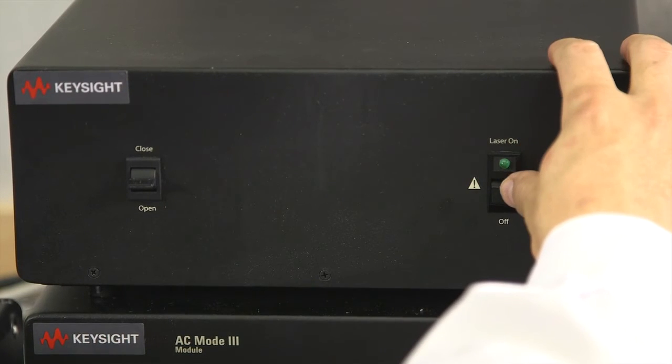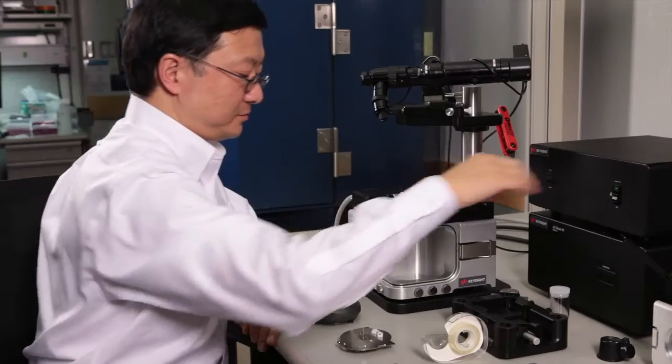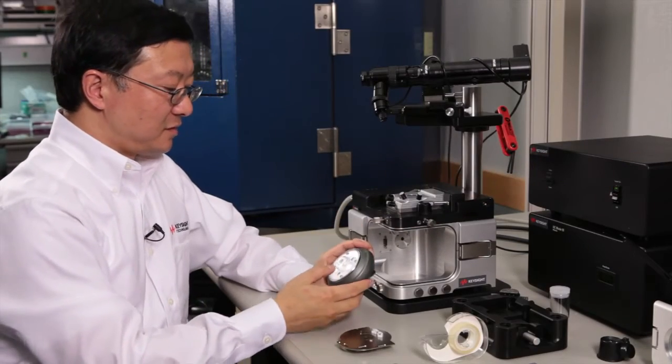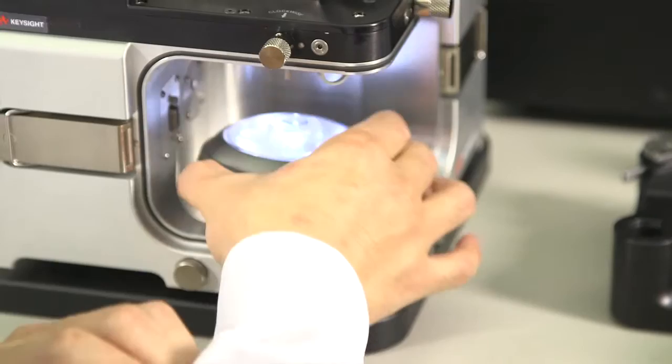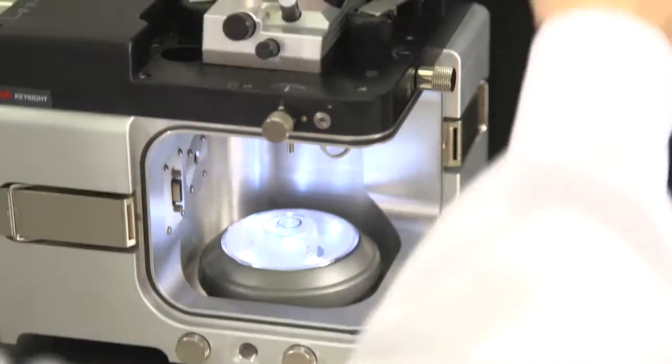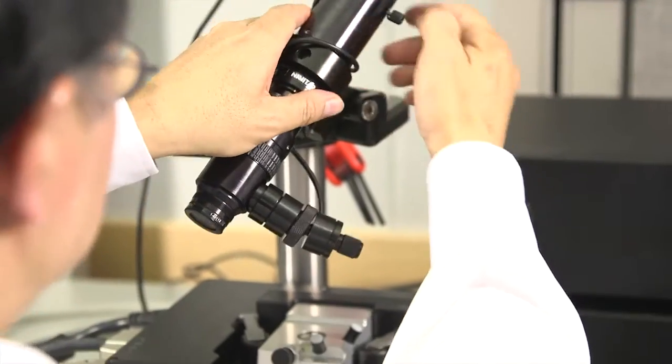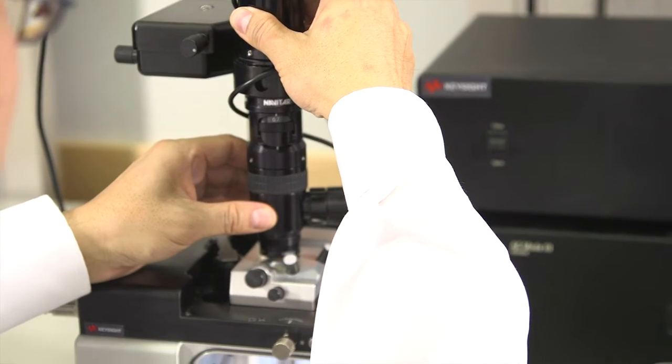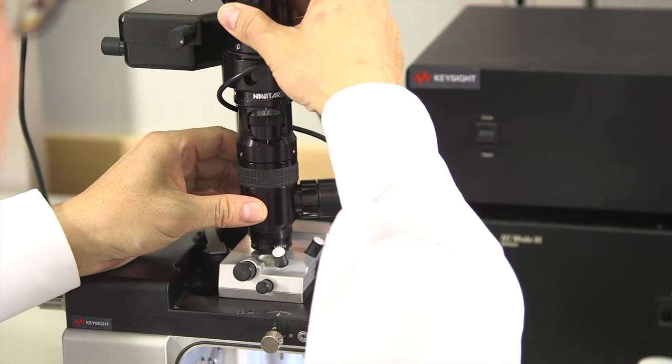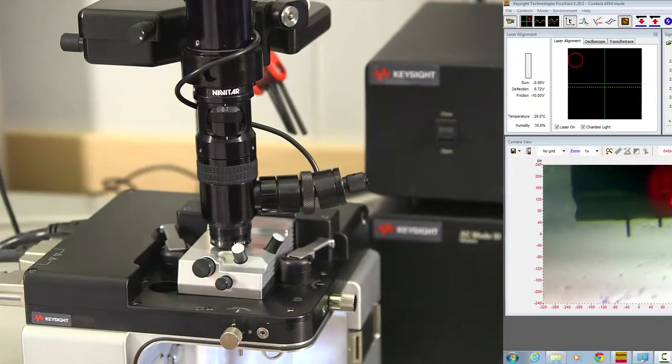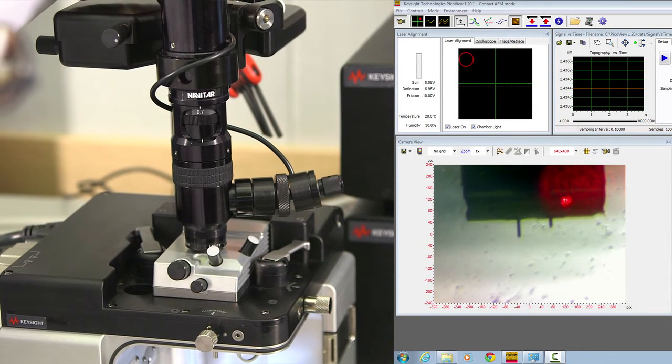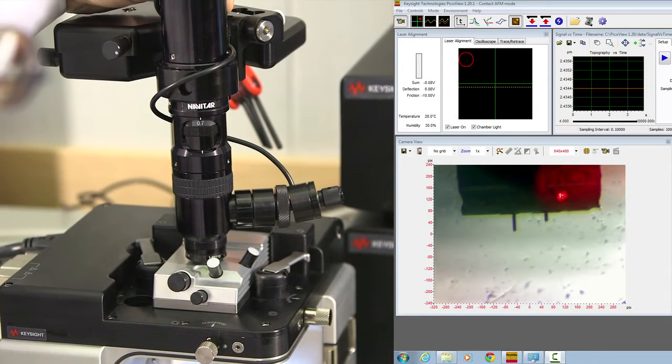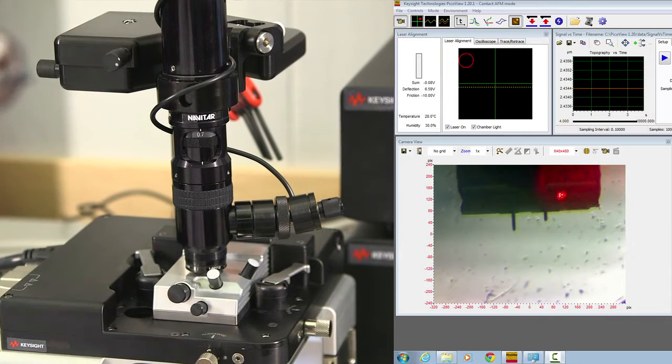Turn on your laser power. Turn on your LED light. Lower the optical microscope so you can see the optical view from the computer. Do the necessary focus so everything is nice and clear.